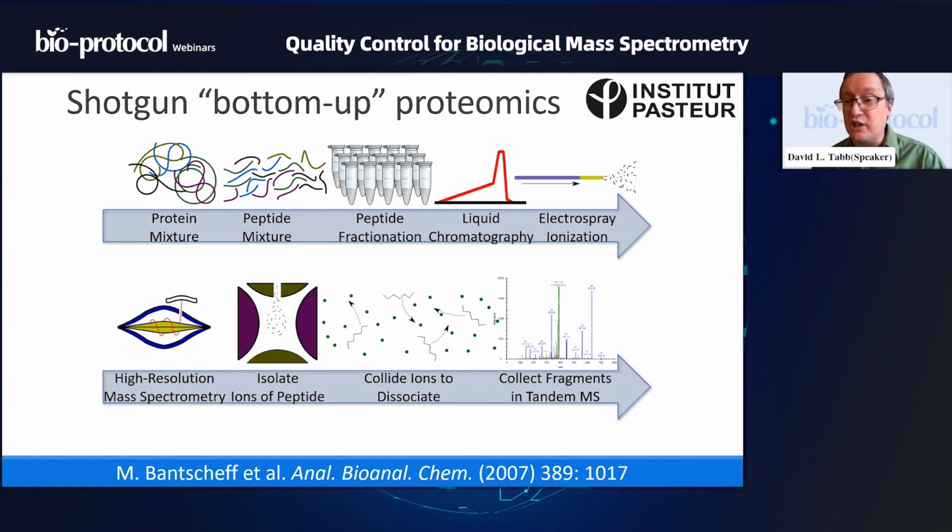Often that means we're zorching them with something like 3,000 volts as they come out of electrospray, and that creates this spray that allows these peptide ions to separate from each other and to desolvate. In other words, to become sort of naked peptide ions flying into the mass spectrometer. The mass spectrometer environment is a high vacuum, generally speaking. So we want these ions to be well desolvated as they come in, and for just the naked peptide ion, with, of course, the proton riding shotgun on it, coming into the mass spec.